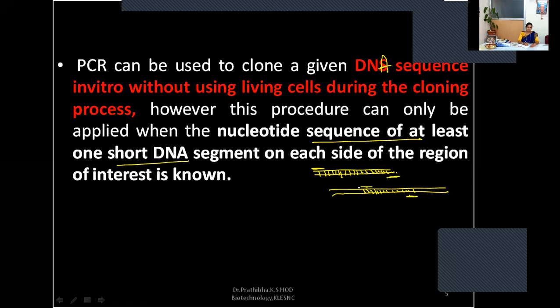Once we know each side's sequences, we can design primers. Primers are single-stranded DNA molecules. Once we know the sequence, we'll design the primer.